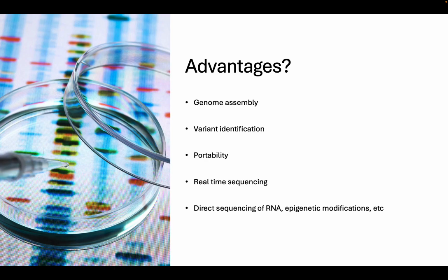One of the long read sequencers is highly portable. But again, because you're not doing the amplification and sequencing, you're just doing the sequencing, you can start to get answers and data in real time. And depending on which long read technology you're looking at, some of these have been adapted to allow you to even do direct sequencing of RNA. And when we talk about transcriptome analysis, we'll talk more about why that would be such a benefit.